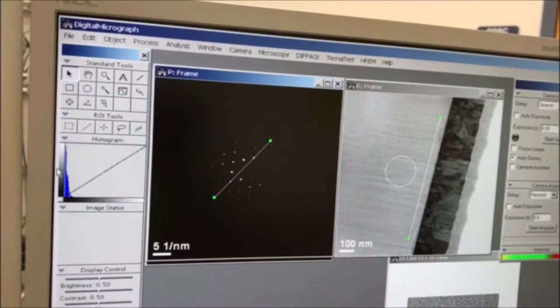Now, one thing I do want to point out is that we saw how if we rotate the pattern 30 degrees counterclockwise, we can get the two lines to be parallel. But I could just as easily have rotated the pattern 150 degrees clockwise and gotten the exact same result.